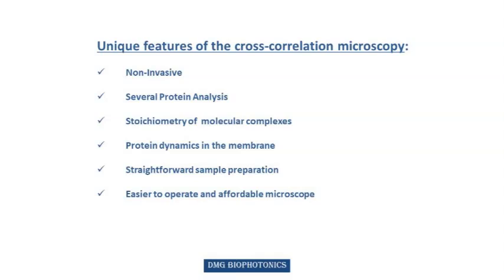At the same time, the method uses a simple sample preparation and user-friendly microscope operation. Altogether, it offers a robust platform for live cell molecular investigations and marks a significant step toward visualizing the previously inaccessible.